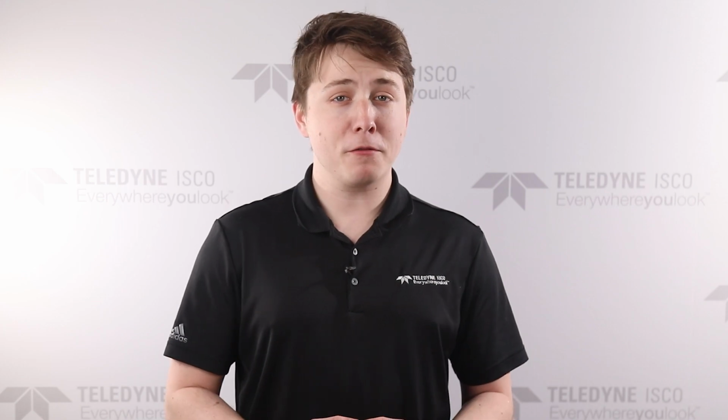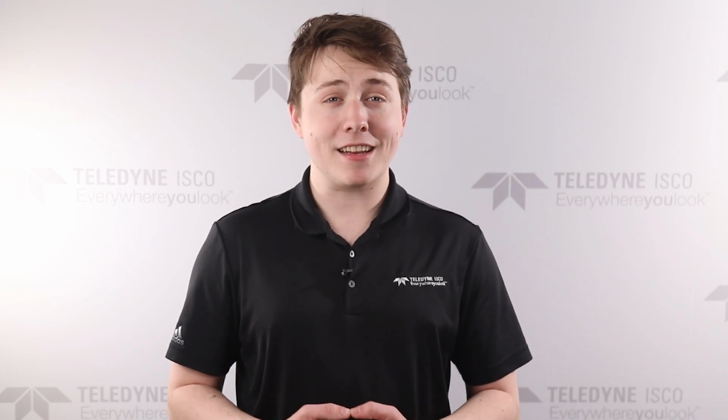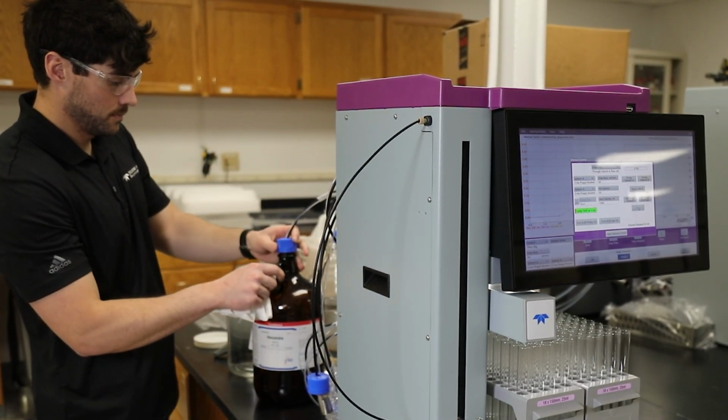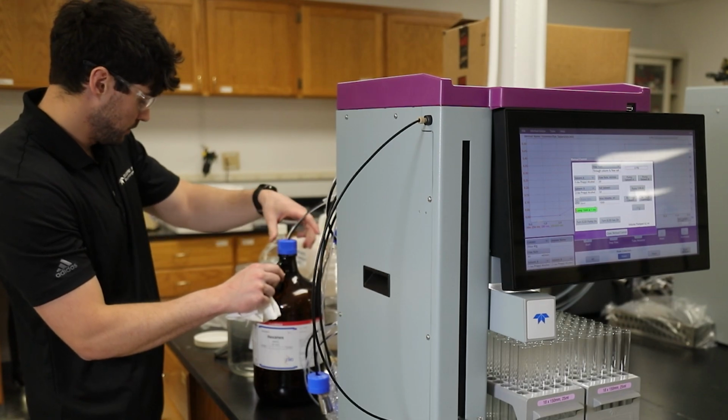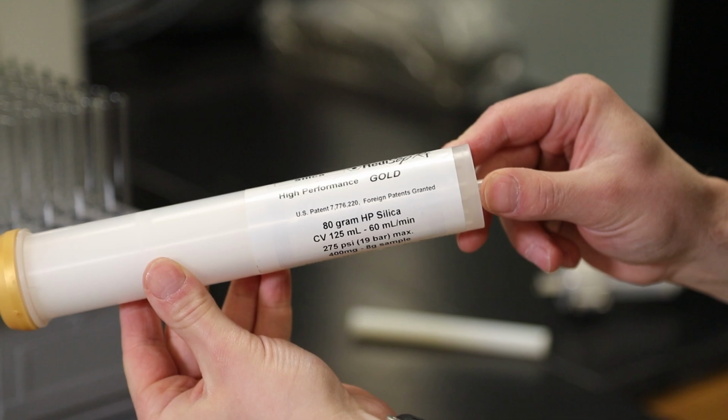Chromatography involves a mobile phase and a stationary phase. Today, we will use a mixture of hexane and ethyl acetate as our mobile phase. The mobile phase will cause the dye to travel down the stationary phase. The stationary phase will be this column filled with silica gel. That's where the separation will occur.